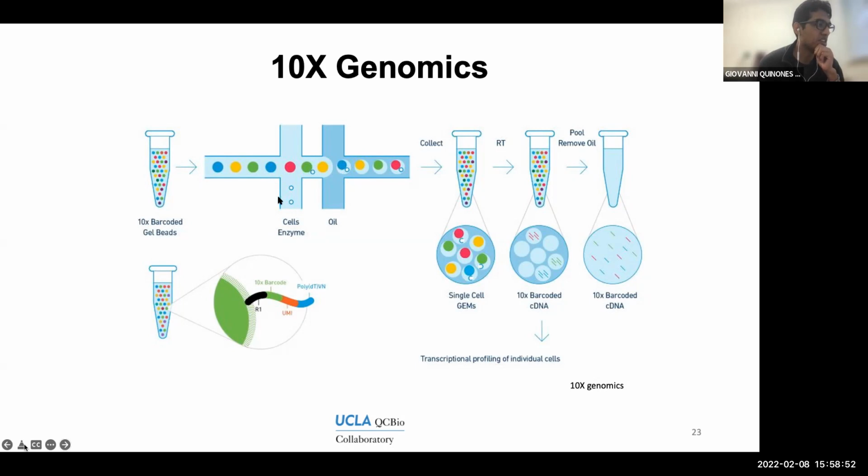And I wanted to repeat once again the mechanism that is being used with microfluidics, where these beads are already prepared, and these beads are meant to be captured inside a drop with one cell. The way that it works is that the beads will pass through this channel, and they will couple together with a cell.